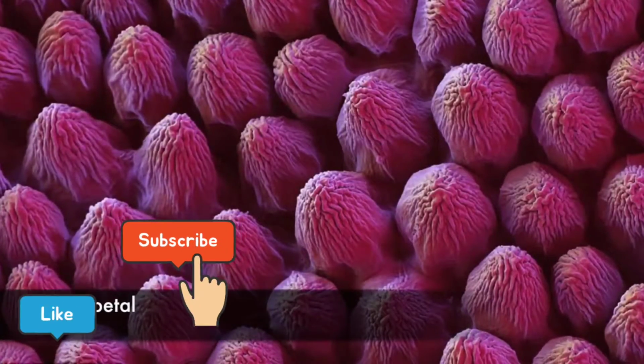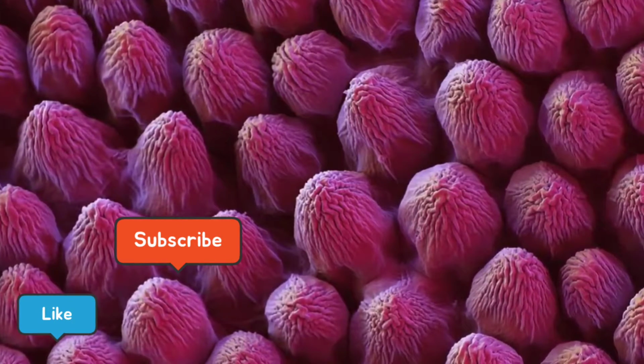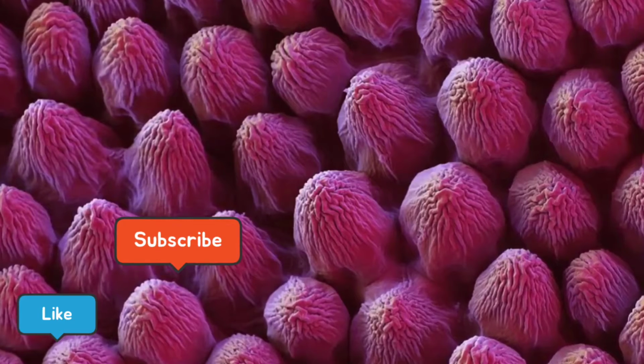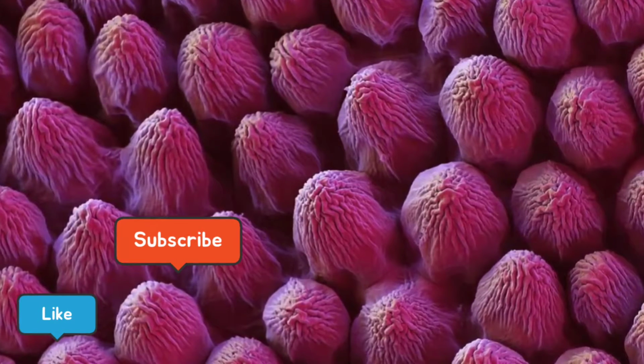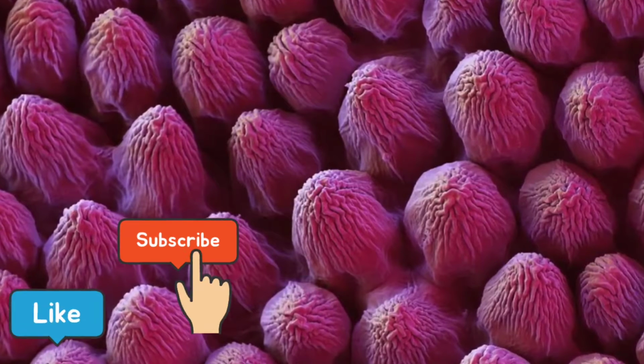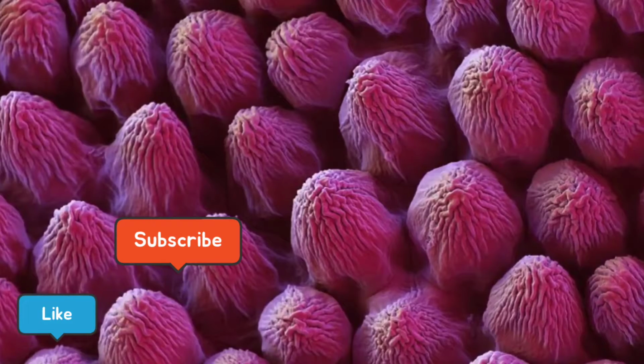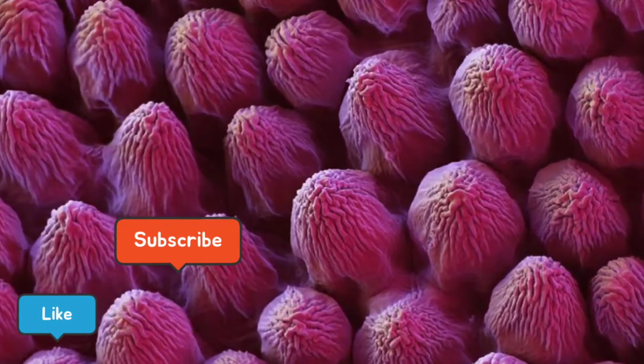A petal from a rose flower, showing the structure of the papillae that make up its surface. Papillae are projections from epidermal cells, and in the rose they are conical in shape. The papillae surface is often covered in a thin layer of wax to reduce water evaporation in the flower. Rose flower petals are also soft to the touch due to the numerous and tightly packed papillae.